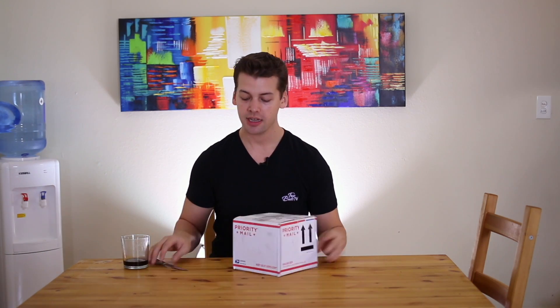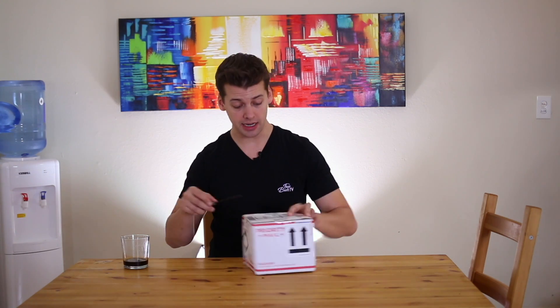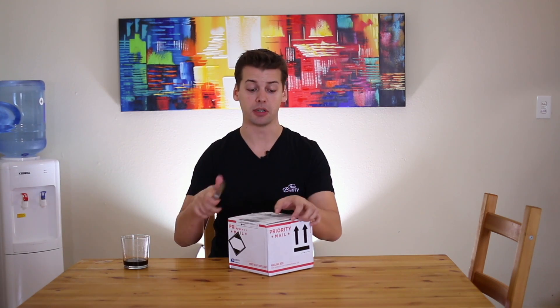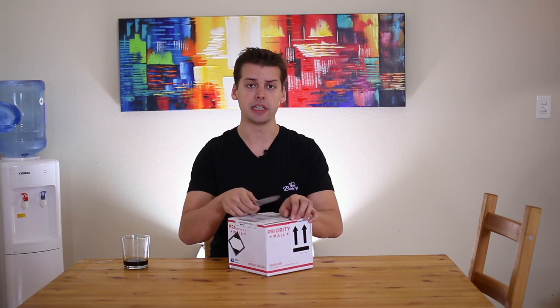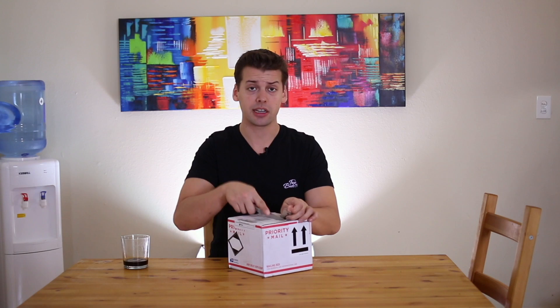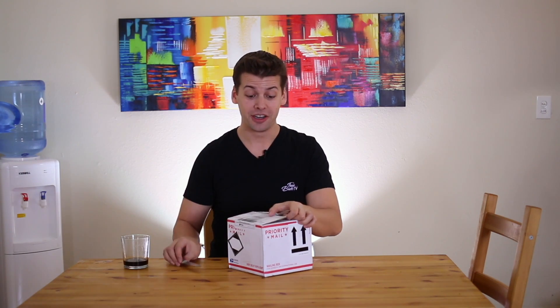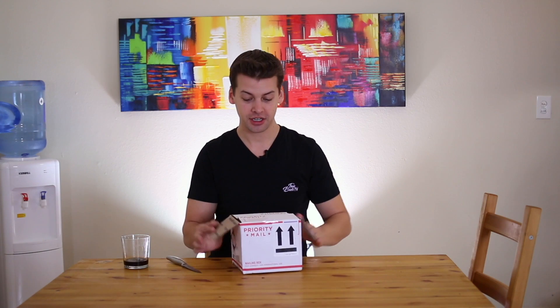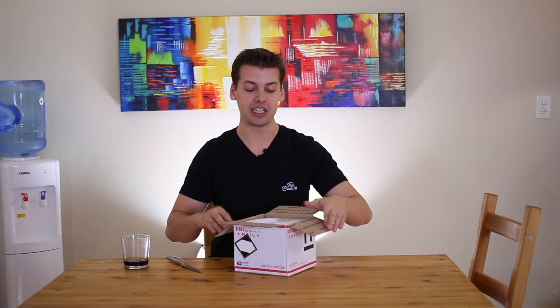What's up? It's time for another TrueBuds unboxing. Shout out to my friends at T-Check for sending this my way. I get questions all the time on my infusion videos — like my coconut oil, my butters — people are like, how strong is it? So I try to do the test at the end of the video, trying to guesstimate and give you my thoughts on how strong I think it is. But now I will actually be able to know for sure because of the T-Check 2.